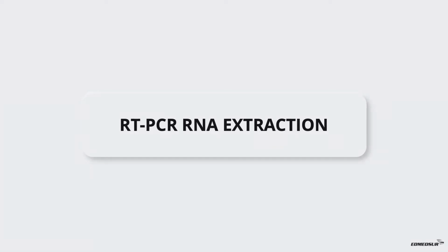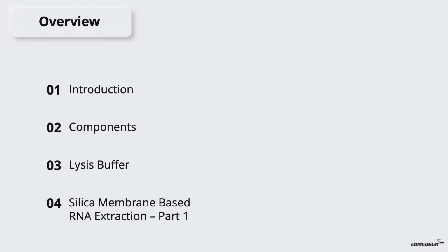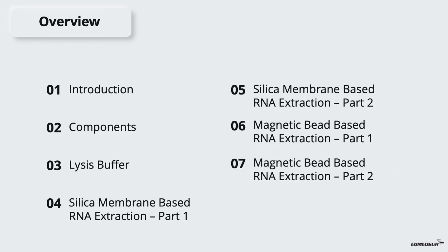RT-PCR RNA extraction. Overview. RT-PCR RNA extraction will be discussed under the following headings: Introduction, Components, Lysis buffer, Silica membrane-based RNA extraction Part 1, Silica membrane-based RNA extraction Part 2, Magnetic bead-based RNA extraction Part 1, and Magnetic bead-based RNA extraction Part 2.